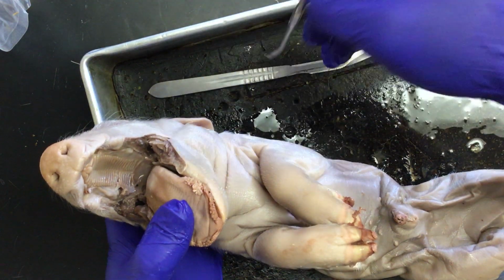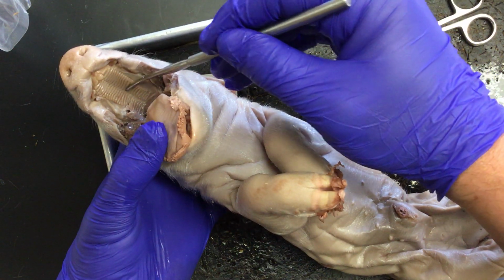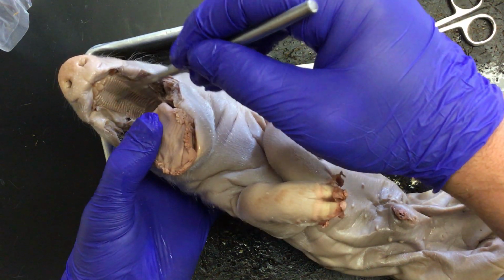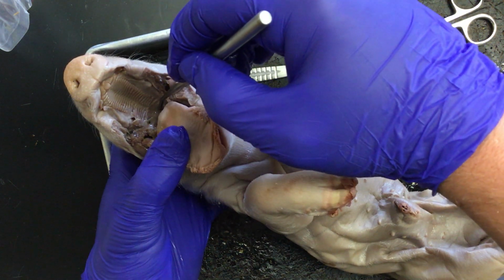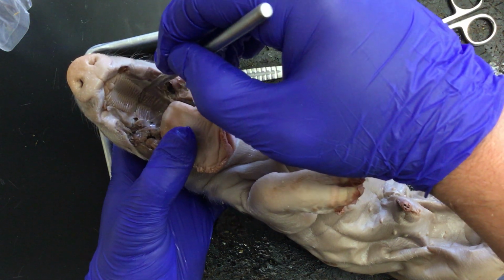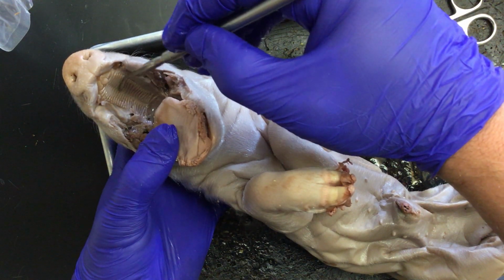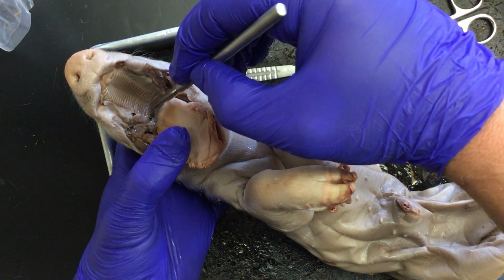Got my blunted probe here. The first thing we're going to look at is the hard palate. These ridges here at the front of the pig's nose are the pig's hard palate. And behind it, this soft area back here is the pig's soft palate. The soft palate is a fleshy portion on the roof of the pig's mouth, just caudal to the hard palate. So all of this ribbed area here, if you could feel it, is decidedly strong tissue. It's not very yielding. Then back here is the soft palate of our pig.